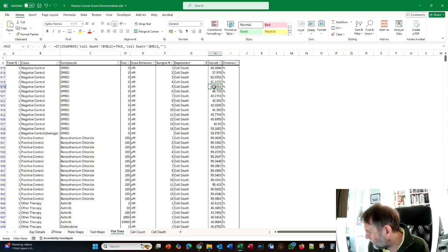You can imagine that maybe they could be legitimately caused on a high content screening experiment by a piece of crud, fluorescent junk in the well, which would then dramatically elevate the measurement of cell death and also throw the cell count data. So let's pretend that that's what's caused that, and let's get rid of these data so that we can demonstrate to you how to use the cell cleaning part of the Platemaker Wizard.